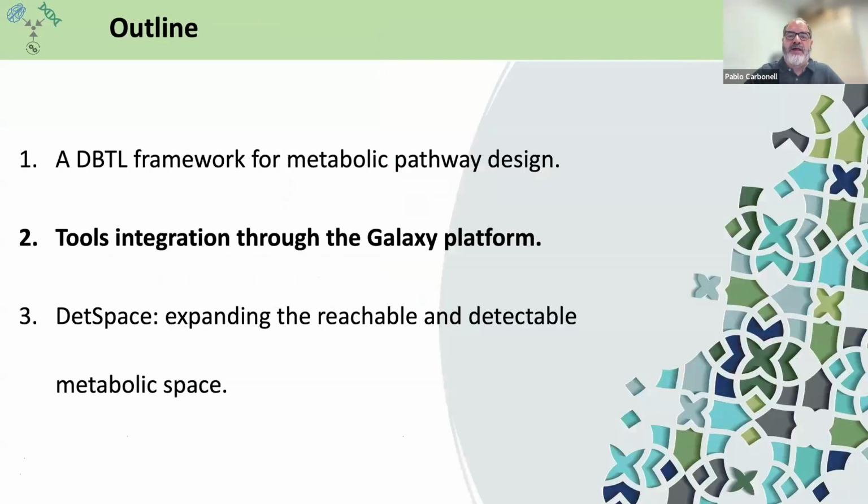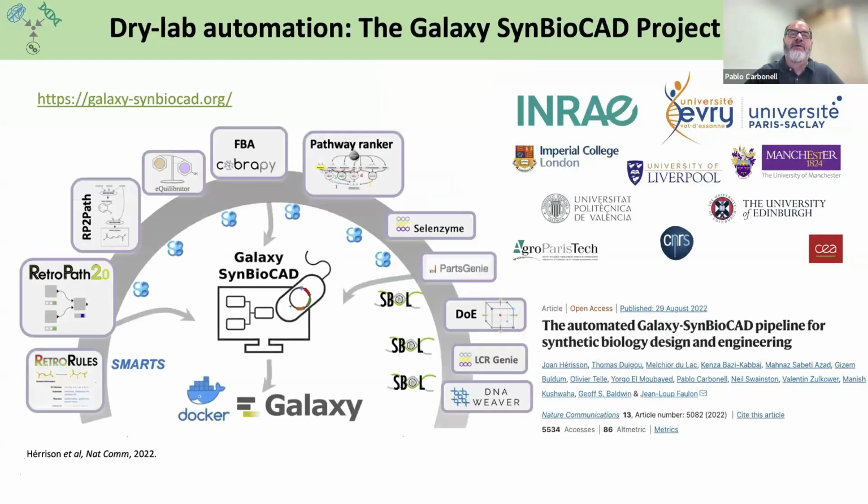But then I would like now to go into the second part of this presentation about the integration of the tools through the Galaxy SynBioCAD platform. This platform has been chosen. The Galaxy system, probably you're familiar with it, is a way of generating workflows or pipelines that basically interconnect multiple tools.